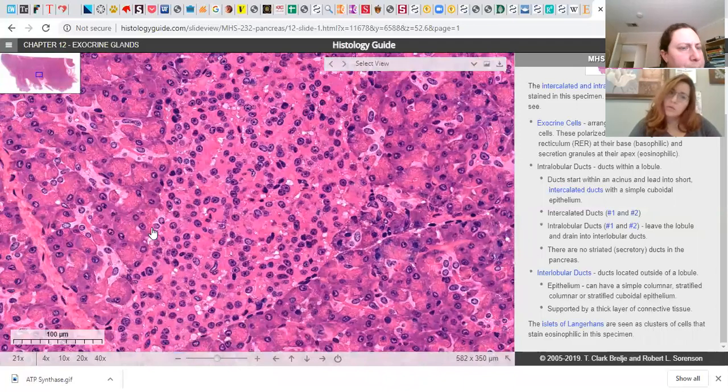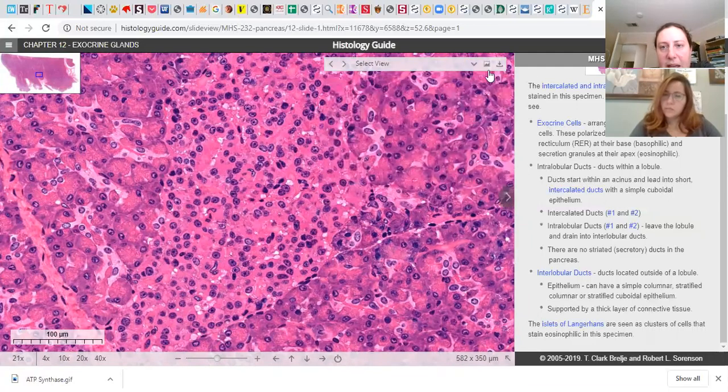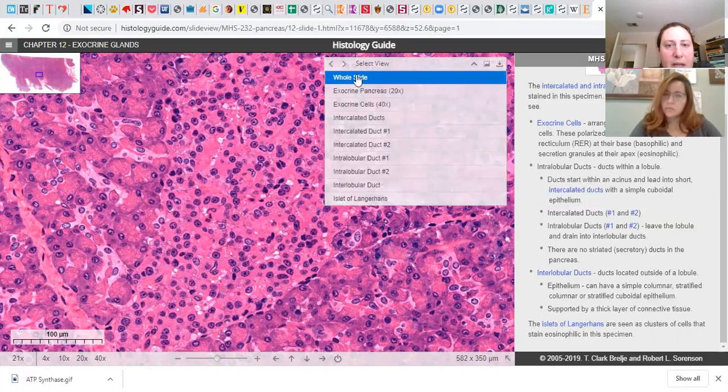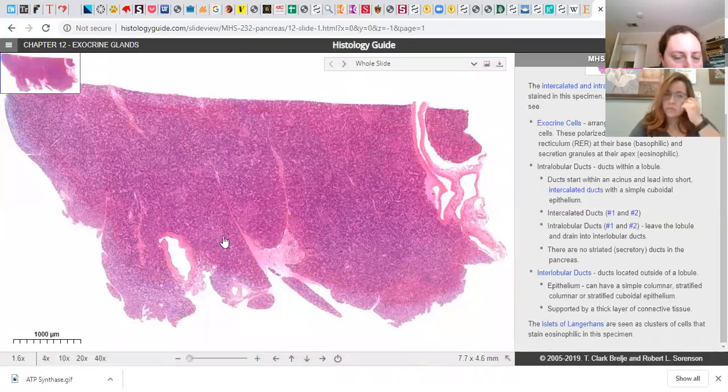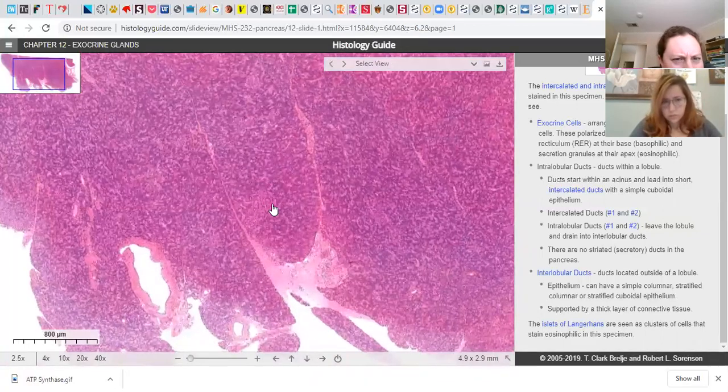Hold on. I have more of that, just the one. No. If you haven't noticed, all the different specific views they have set up over here, you can also just ask for, which is kind of cool. So there are definitely more of these guys. You can usually spot them, like, oh, there's one.